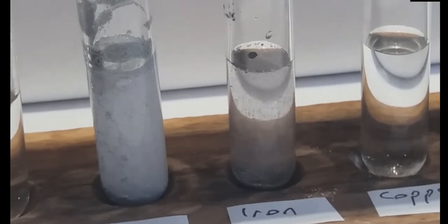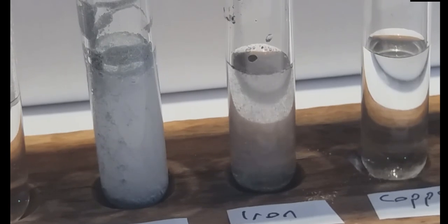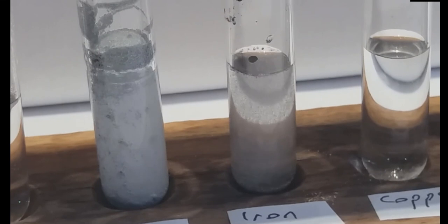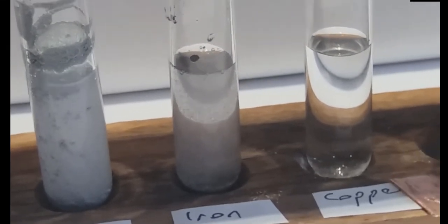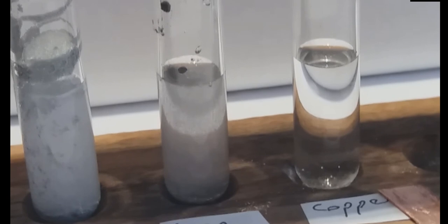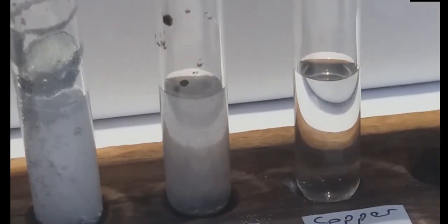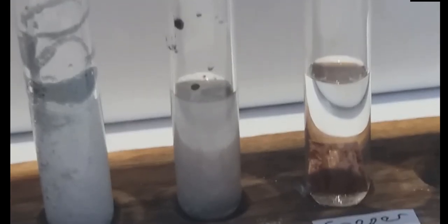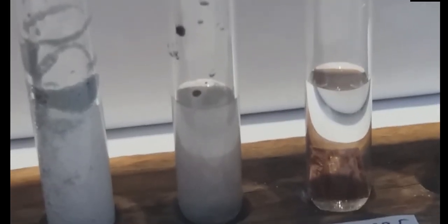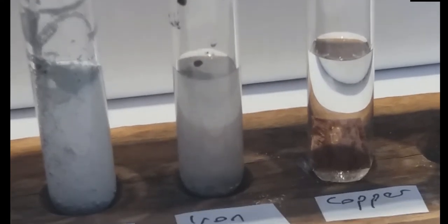So you can see we've got a reactivity series there, really, haven't we? Magnesium really fast, zinc a little bit slower, iron slower again. But they all react with the hydrogen sulfate, so they're stealing away from it. And then finally, there's a little piece of copper. And it doesn't matter whether we use a lump of copper or copper powder or anything else. Nothing. You can see there the copper isn't reacting at all.